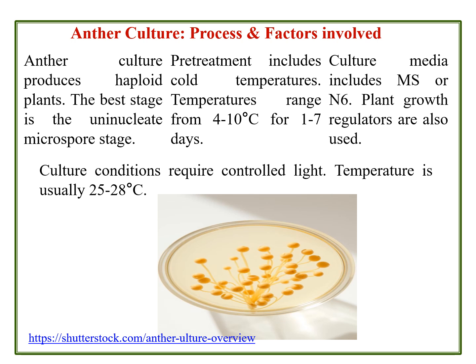N6 medium is also used for the anther culture. Plant growth regulators are also used to culture the anthers. Of course, since it is an organized culture, cytokinins are more required than auxins, and the culture conditions require controlled light and temperature, usually 25 to 28 degrees centigrade.